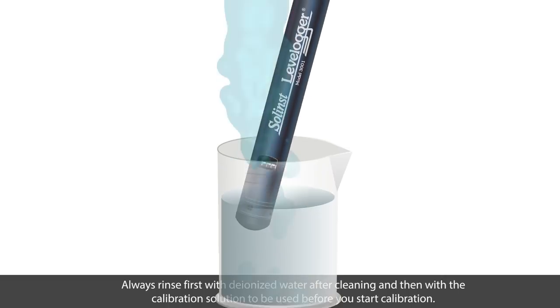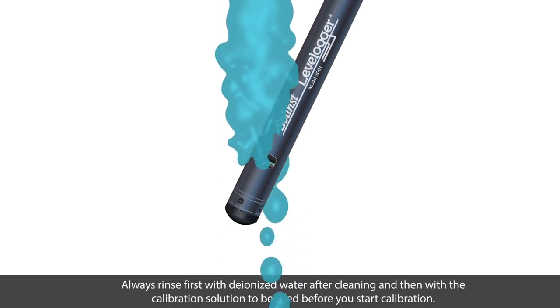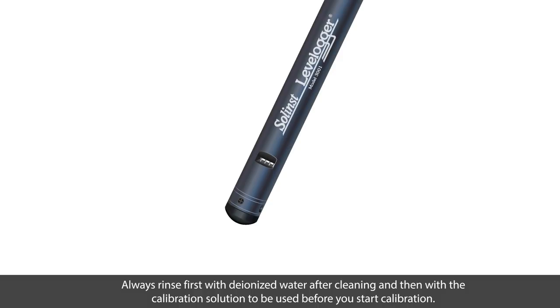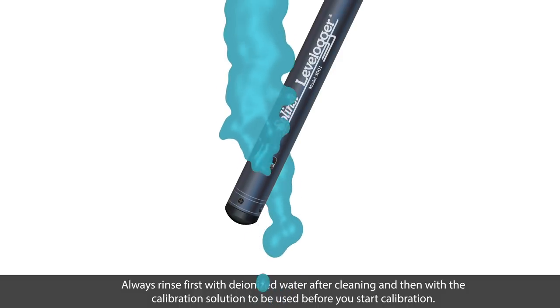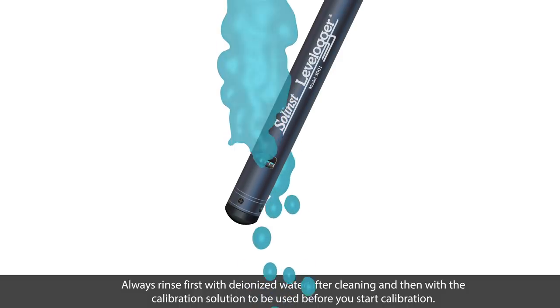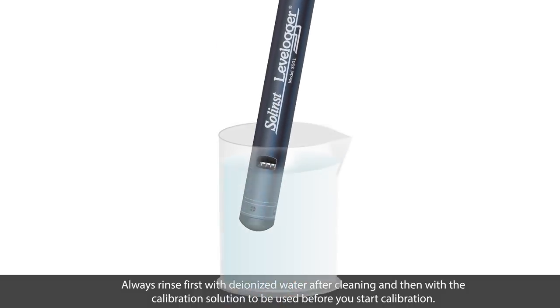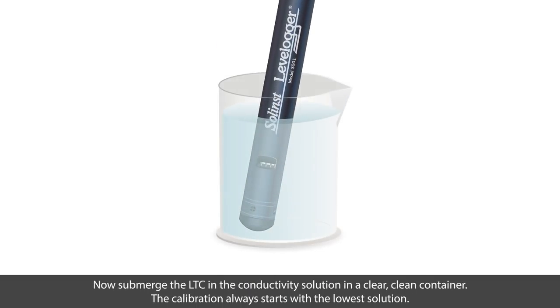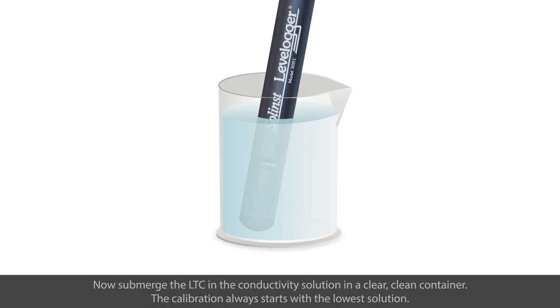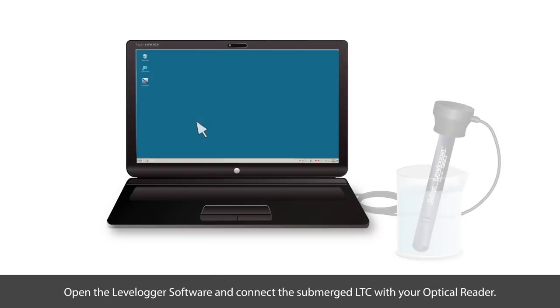Always rinse your level logger with deionized water after cleaning, and then with the calibration solution to be used before you start calibration. Now submerge the LTC in the conductivity solution in a clear, clean container. The calibration always starts with the lowest solution.